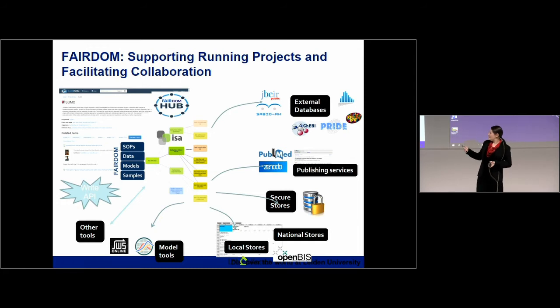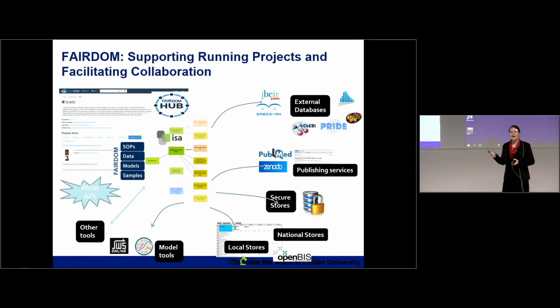And of course, the platform itself allows not only sharing of data, but also all sorts of processing of data. So you can do simulations of models through the platform. You can link out to other databases and pull more data into the platform. We now also have a link to Galaxy Workflow, so you can do various kinds of bioinformatics analyses on your data too. So all of these things came together to allow the individual scientists to see the advantages of this and the incentives for them.